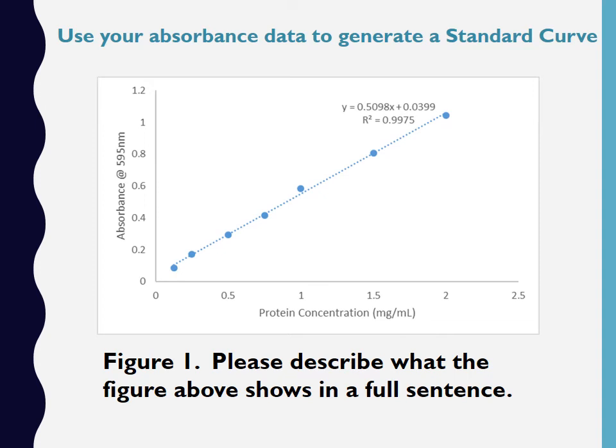Please remember that when you are embedding this graph into your lab report that you need to include a figure legend. So again, we don't use chart titles, we use figure legends. Since this is your only figure, it will be figure 1, and after figure 1 you need to have a descriptive sentence or two that's telling us exactly what is being displayed or depicted in your graph.